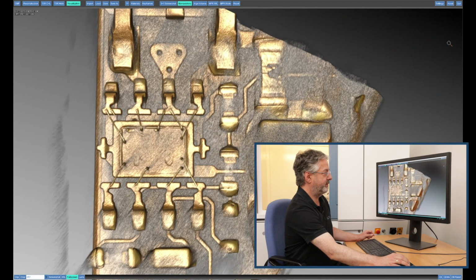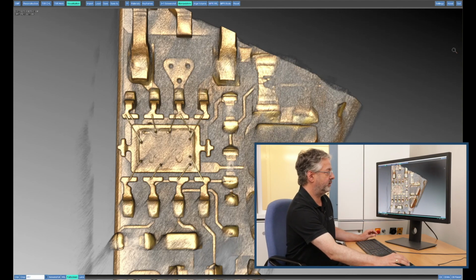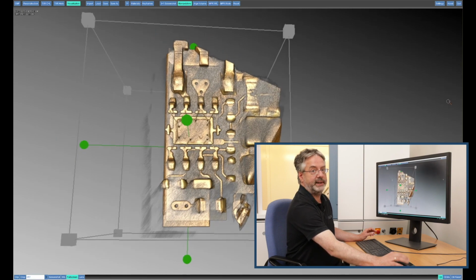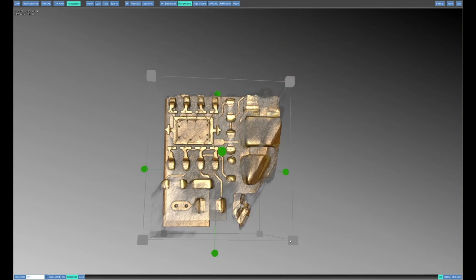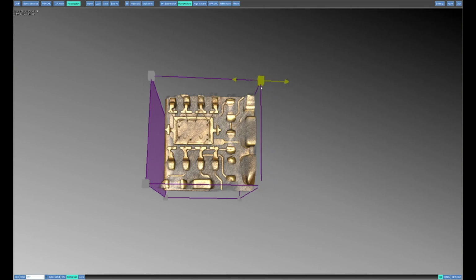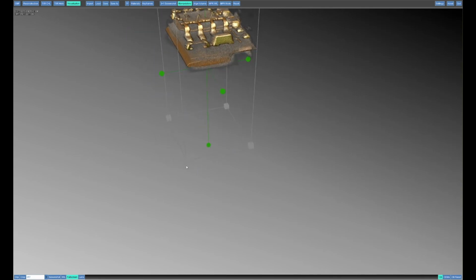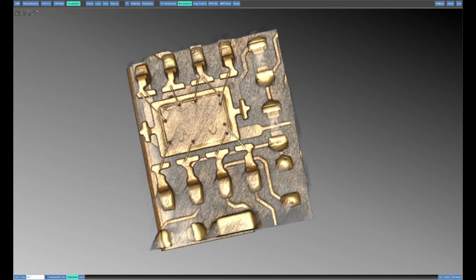Next is, because we have only a small region of interest, you can remove everything you don't want to see in your region of interest. So you can use here the clipping box. It's really a box around your volume. So, with shift control, just move it a little bit and remove everything that's not looking so good. So here and maybe here a little bit. And also you see from the visualization and everything, we have only a few buttons. This is what you need really.